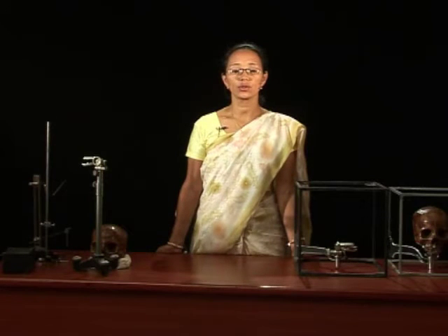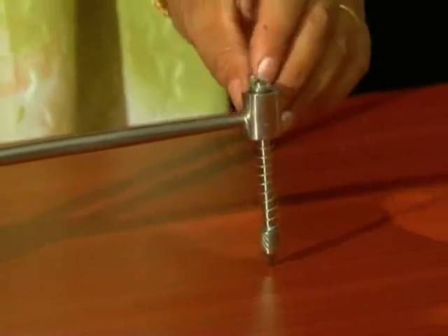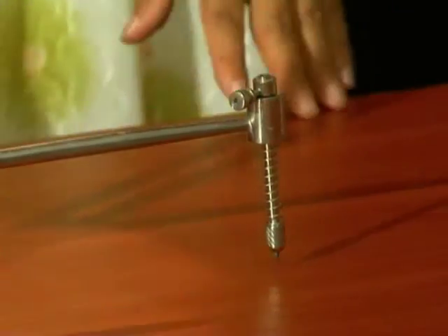It should also, as far as possible, remain at right angle to the skull cap. In case of apertures, the pencil should be kept higher so that it should not spoil the paper by smudging the drawing. Utility. The diagraph instrument is used for drawing the contours of the skull, which is properly adjusted in FH plane on the cubic craniophore. The contours so drawn are utilized for taking indirect angular measurements.